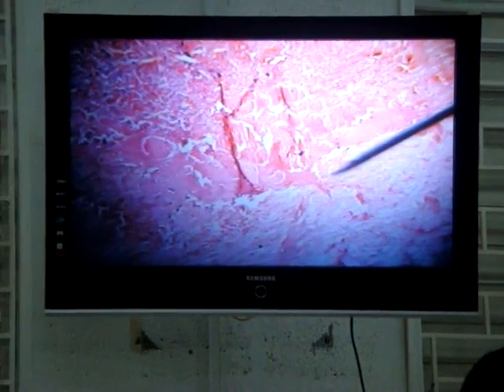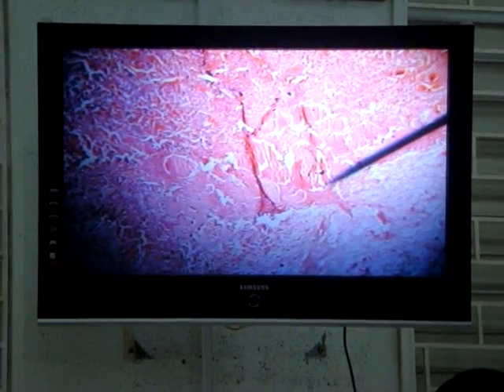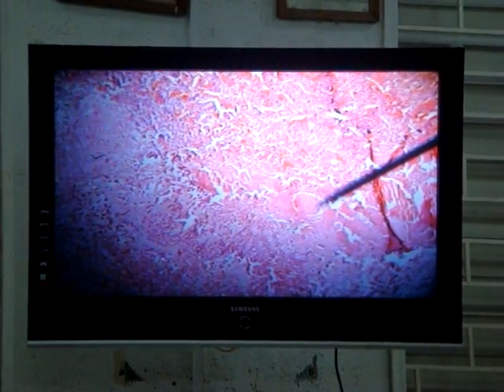Observe a small area between the two. If you look on the screen, you'll notice this little area here with some follicular looking structures. This would be the pars intermedia. In man, the pars intermedia is not well developed. It is well developed in lower reptiles and so on, but not in man. So you should be aware of its existence and the function of what is produced by it.